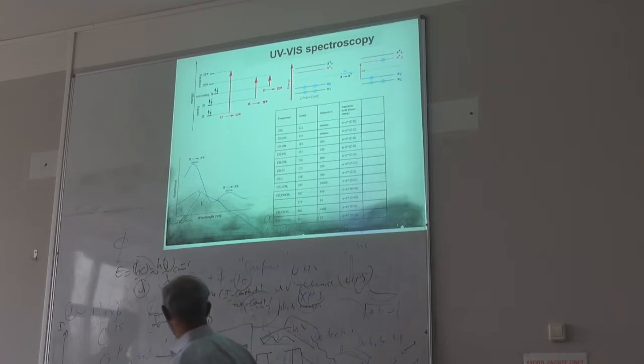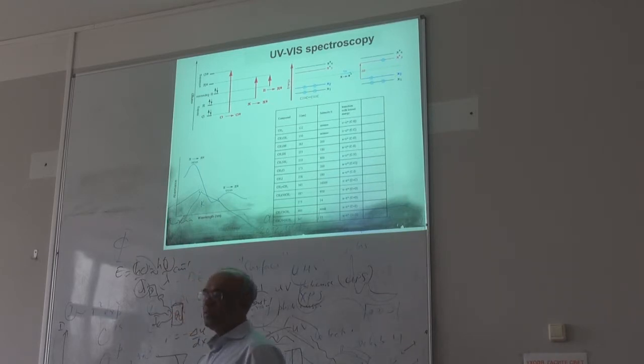In that case, you look at what is reflected from here. Your detector is here now. You have no transmitted term here. So if you look at R, what you measure is typically the absorption.